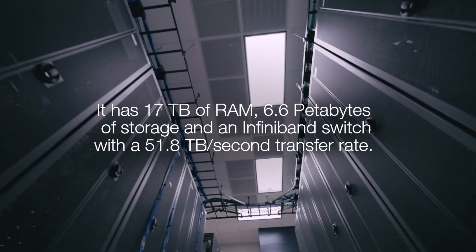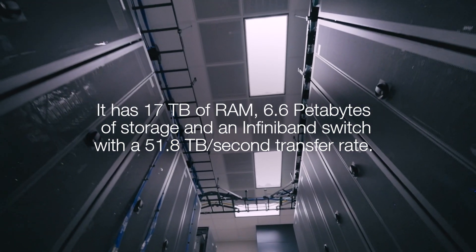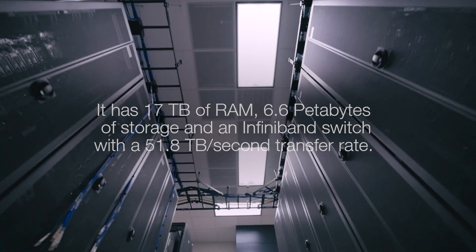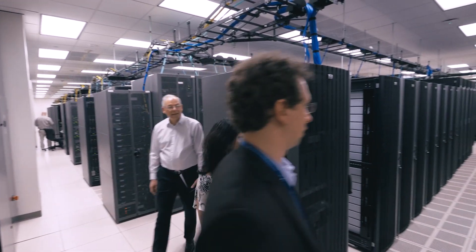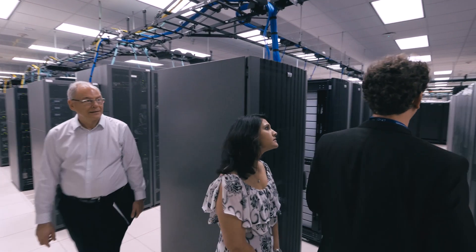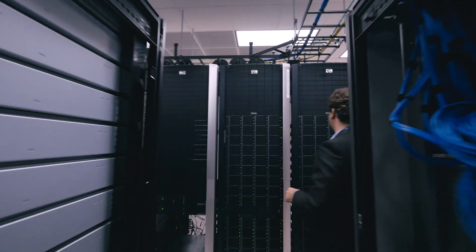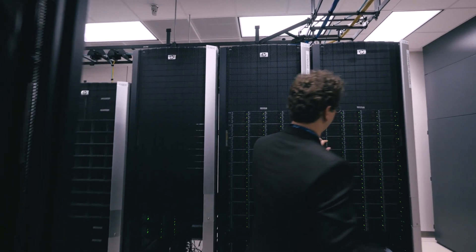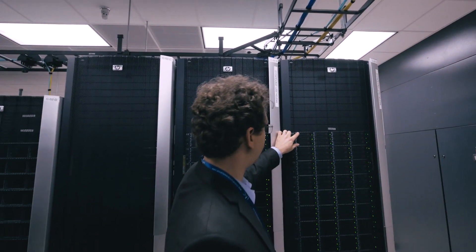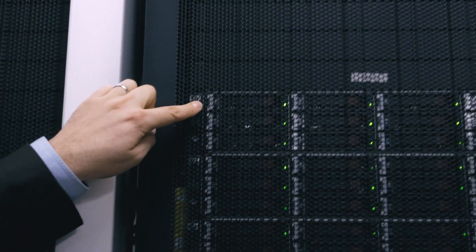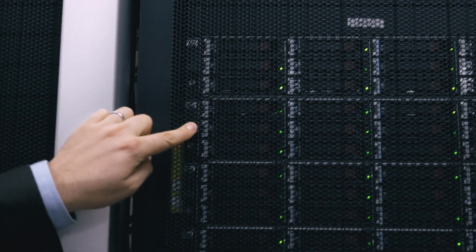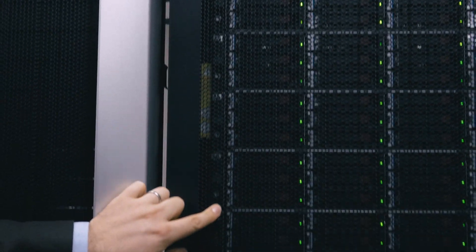So as soon as we get all of the sequencing data back from the sequencing machines, the first thing we do is we take those millions and millions of reads and we upload them to the cluster where we're going to do our initial data processing and analysis.